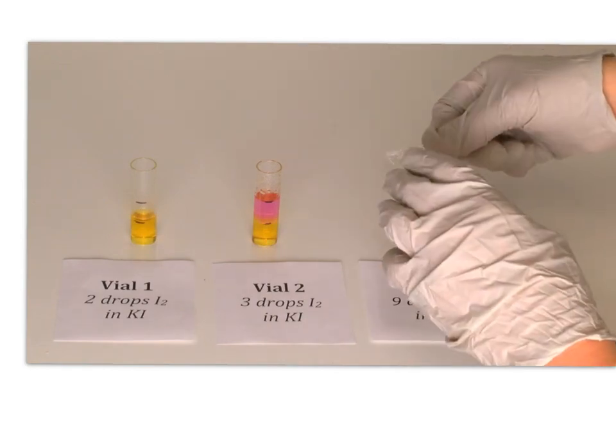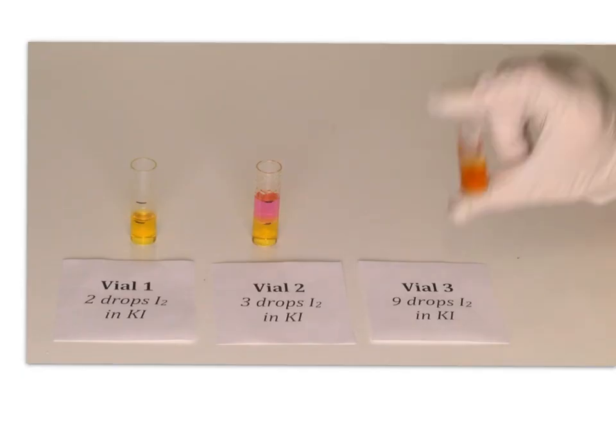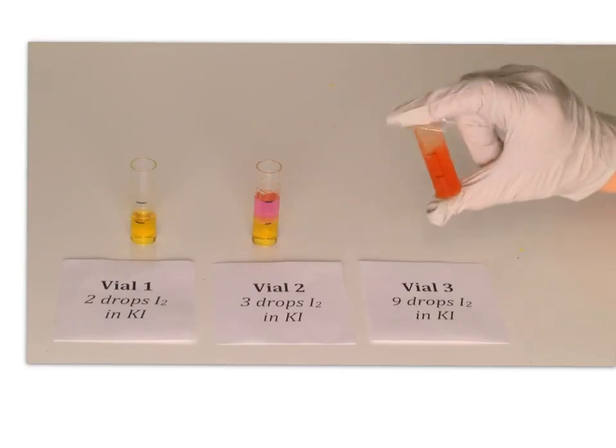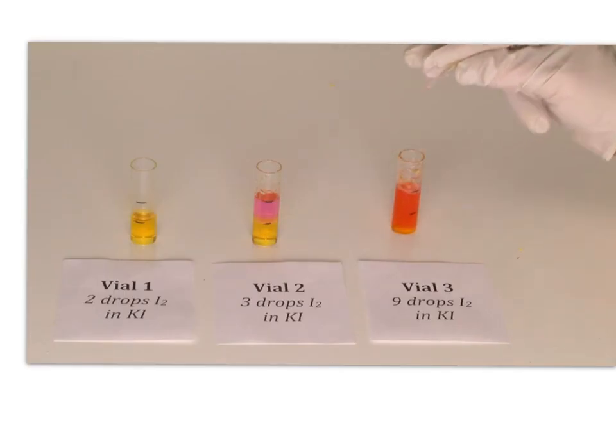The vial is shaken to mix the layers, allowing some of the iodine to move into the hexane layer. After the layers reform, it is clear that more than 1 drop of the iodine moved into the hexane layer. The question now is, how many drops of iodine remain in the aqueous layer?